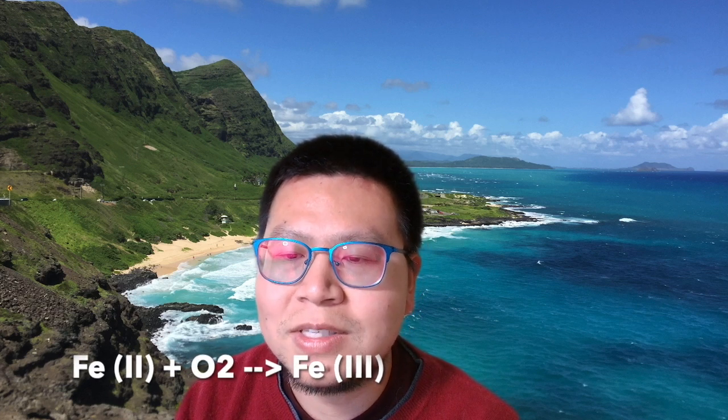It is important to note that most ferrous salts are not inherently stable over extended periods of time. Oxygen in the air would readily oxidize ferrous ions to ferric ions. Consequently, further purification is necessary to obtain pure ferrous salts to prepare the ferroin indicator for the BZ reaction.